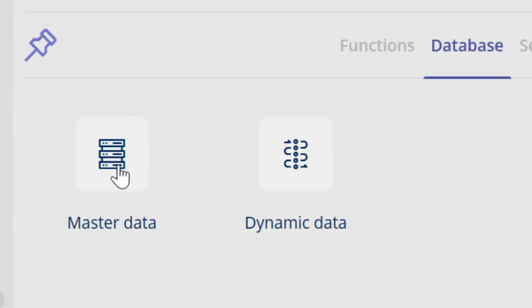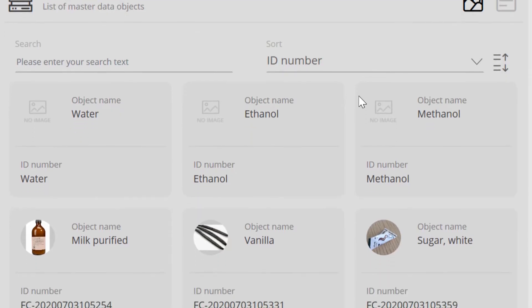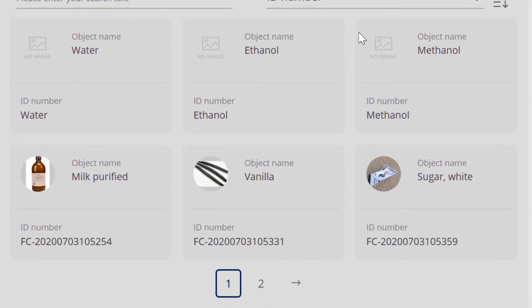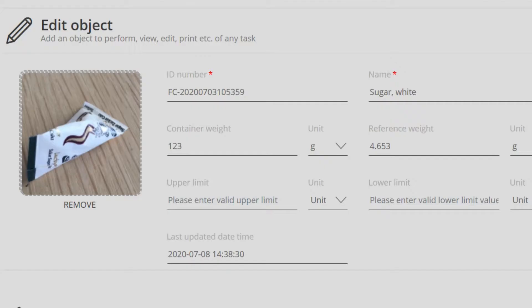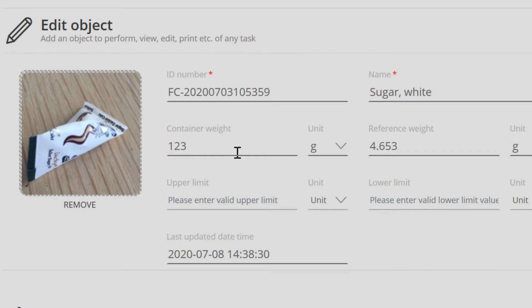Weighing objects for all functions can be stored in the central master data memory. In addition to an image, a variety of properties can be added to these objects, such as a fixed tare value or a piece counter value.